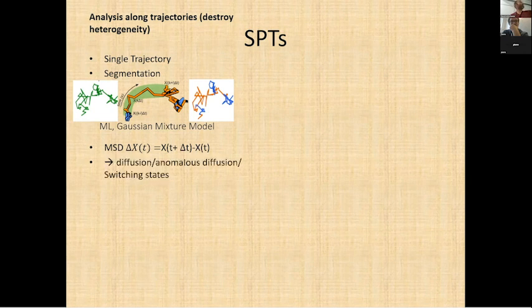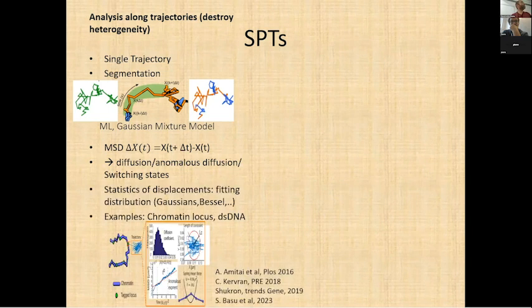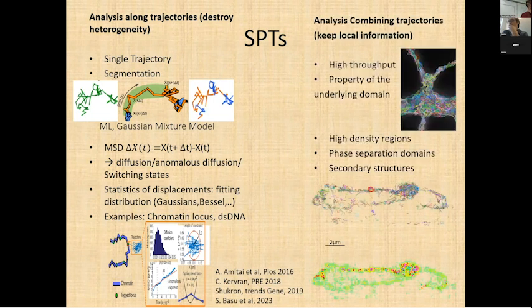So you can calculate diffusion, anomalous diffusion, and you can calculate the switching rates. You can calculate any statistics of interest, and there are many ways to do it. We developed tools using 4 parameters, so you can classify in 4-dimensional space using machine learning. If you're interested, it's not in here. The plugin exists. You just have to download it. You go to ImageJ, Fiji ImageJ, and you go to plugins, you go down, and you go to SPTanalysis. But now it's just a general presentation.